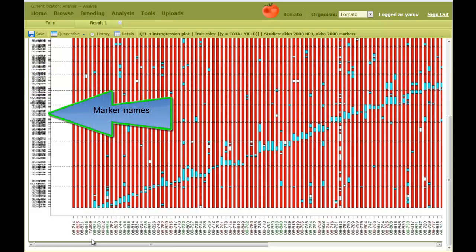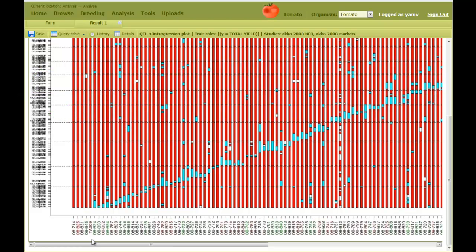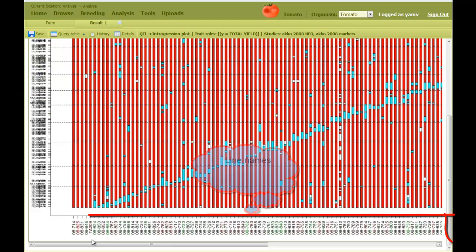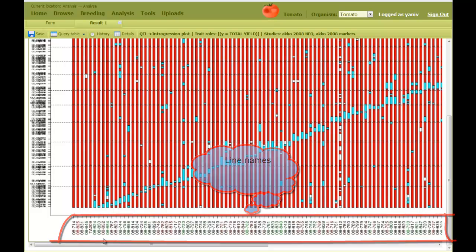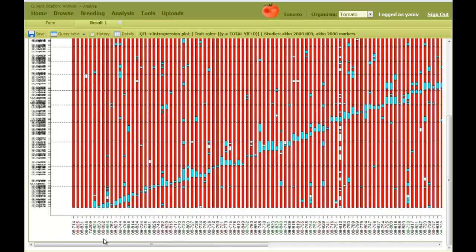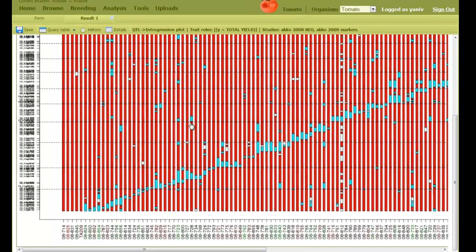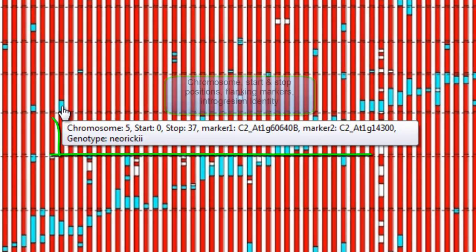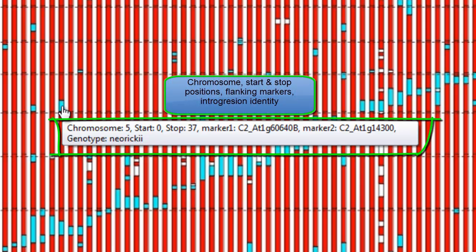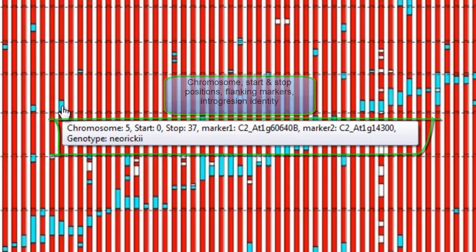Horizontal lines represent the chromosomes. On the left, there are marker names. Line names appear below, and they are colored according to the trait's value, such that green is low, black is average, and red is high. When I point on an introgression, I can see the chromosome name, start and stop positions, flanking markers, and the introgression identity.